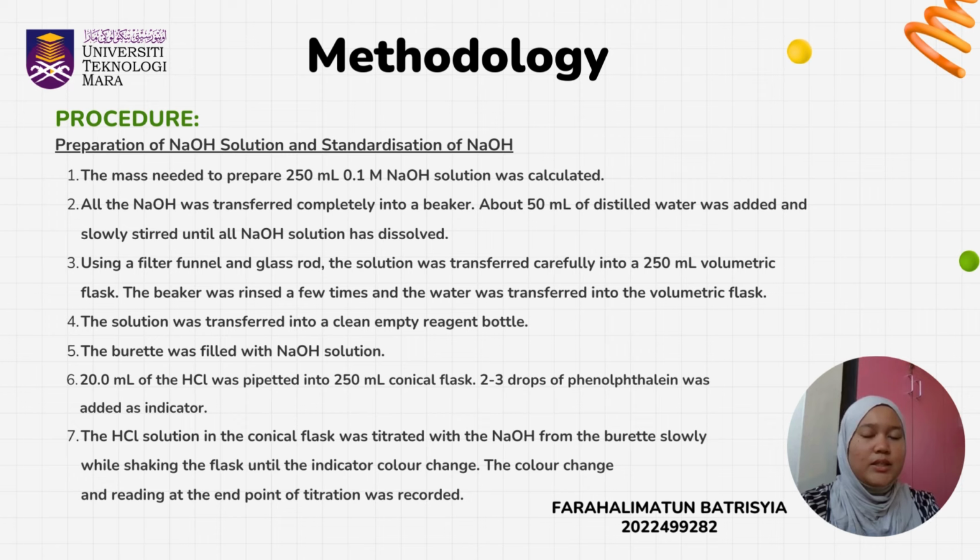Next, the HCl solution in the conical flask was titrated with the sodium hydroxide from the burette slowly while shaking the flask until the indicator color changed. And the next step is the color change and reading at the end point of titration was recorded.